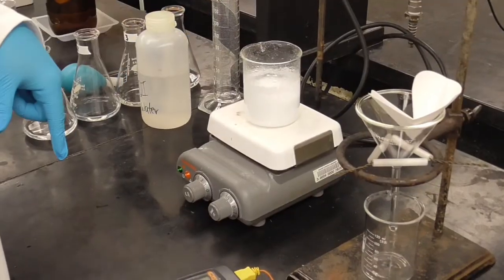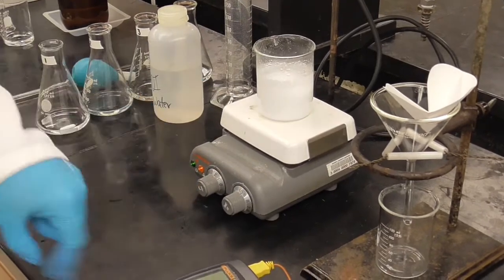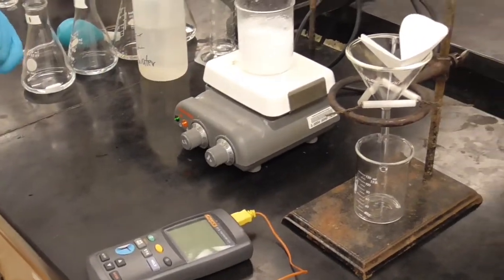Okay, so it's been boiling for 5 minutes. You can see it there. I'm going to turn the stirrer off. I'm going to set it down. I'm going to measure the temperature, and then I'm going to hot filter it.